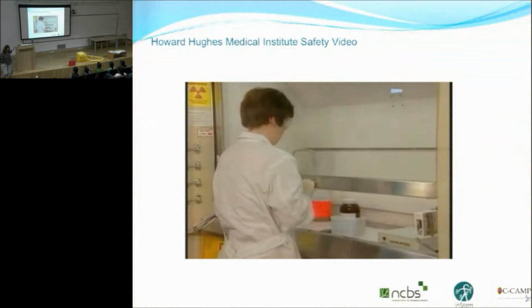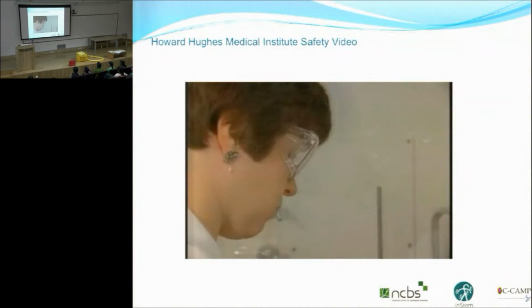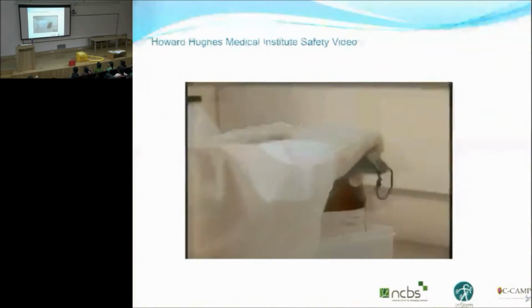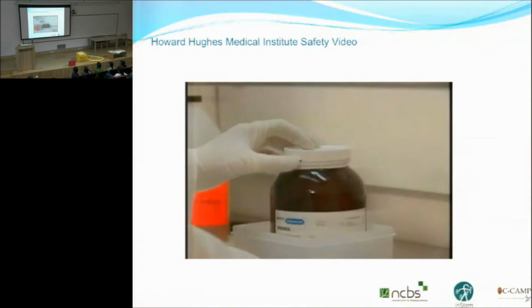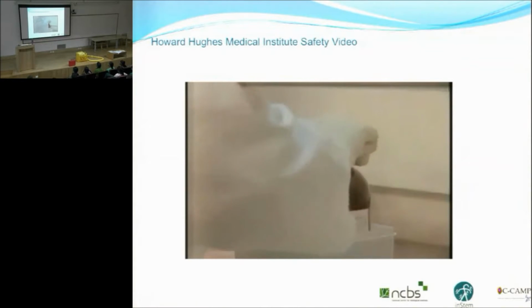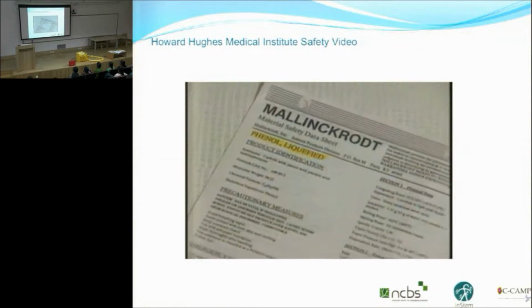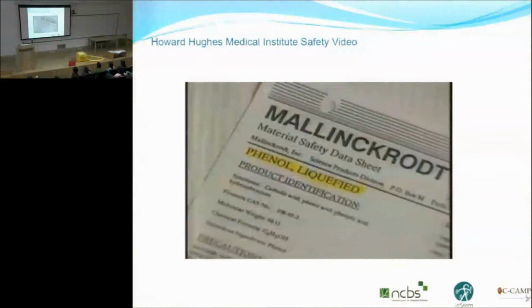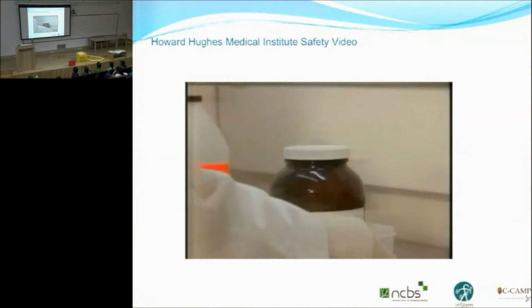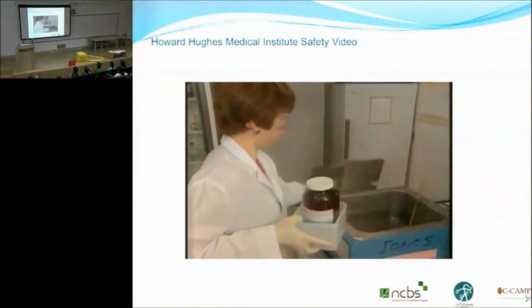Where and how you perform a procedure should be determined by an understanding of the task at hand and the chemicals involved. This morning, Gretchen Hannon is going to prepare a series of DNA samples using phenol chloroform extraction and ethanol precipitation. Her first step is to equilibrate the phenol. The Material Safety Data Sheet is a good source of information about a chemical's hazards. Laboratory workers should be familiar with the relevant ones. The MSDS for phenol tells us it is a powerful corrosive and causes serious burns on contact with skin.